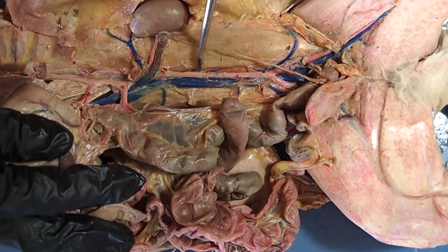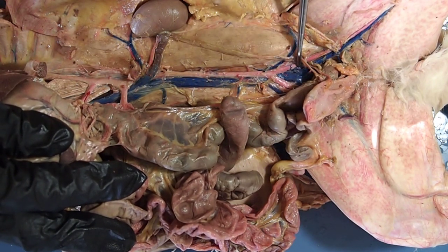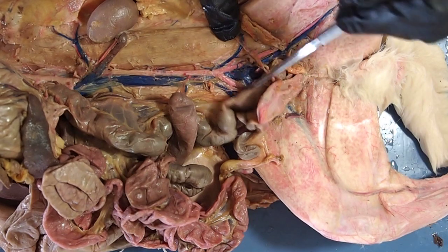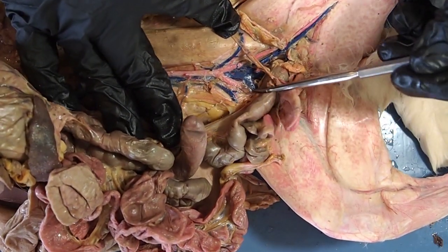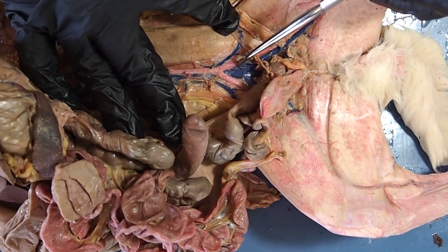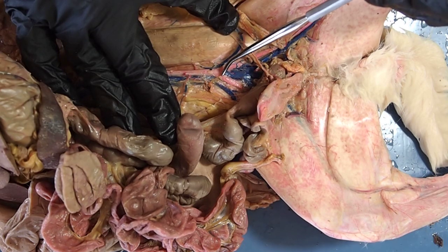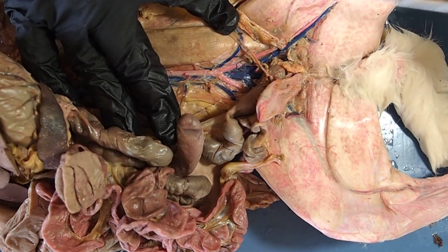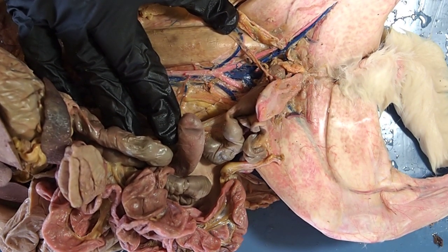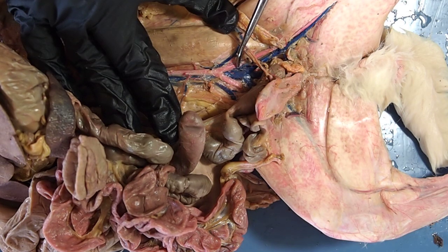Moving on down the abdominal aorta and inferior vena cava, we hit this series of upside-down Vs. The ureter is in the way here, so we'll move it aside. The abdominal aorta essentially dead ends here — no more aorta. One branch goes off to the right leg and one branch goes off to the left leg, because we still need to supply our legs with blood and drain the deoxygenated blood. These two vessels are my external iliac arteries, supplying the legs with oxygenated blood.